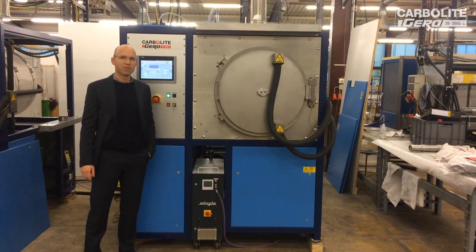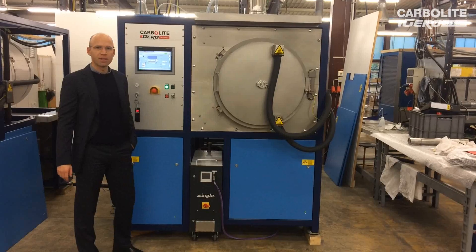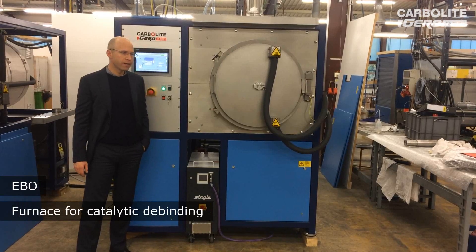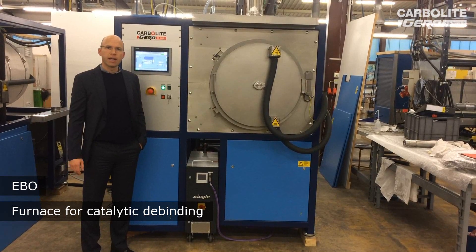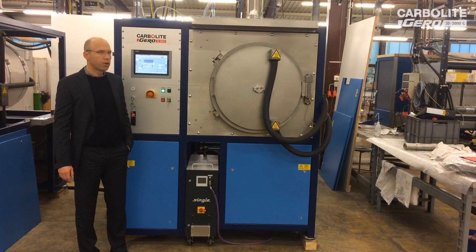Hello, my name is Tim Ruhnweiler from Carbolite Gero. I'm a project manager and today I want to present our EBO. The EBO is a furnace for catalytic debinding and it will be delivered next week on Monday. I will take the opportunity to explain how this furnace works.